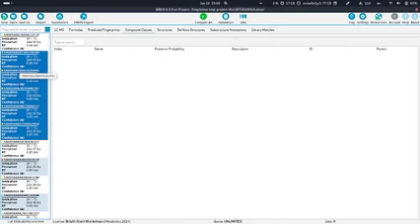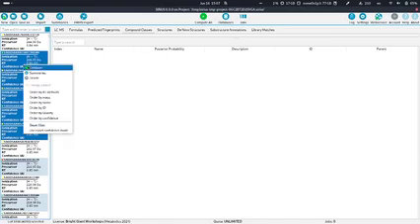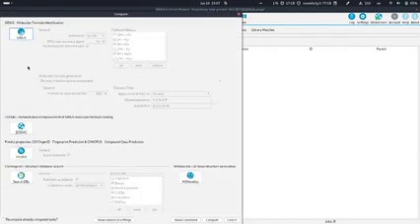If someone also wants to actually do computations, it would probably be a good idea to not click on compute all, because it can take a little bit. If you don't want to wait, just select, I don't know, 4 or 5 features here. You can just use your normal shortcuts, which you would also use in the file explorer. For example, you can shift select or control select to select multiple compounds. You can even hit Control A to select everything. And now let's again right click and click on compute.